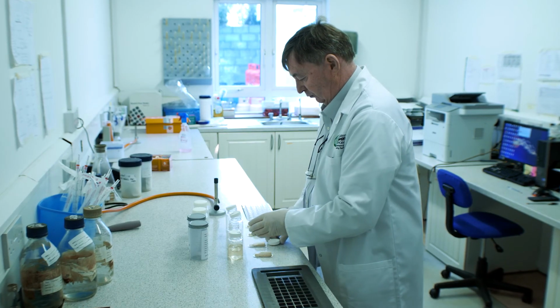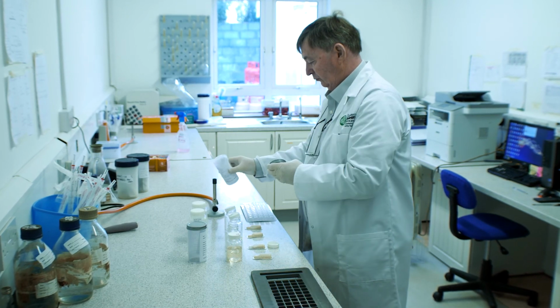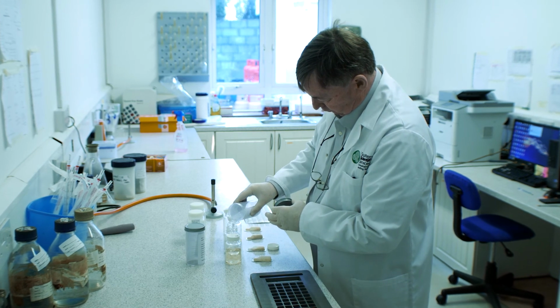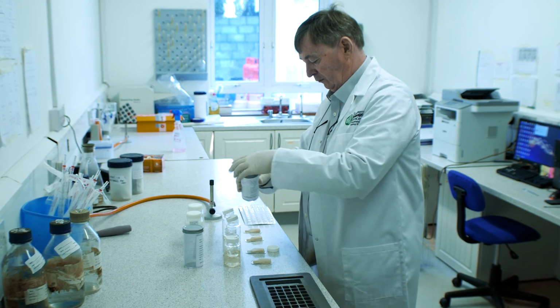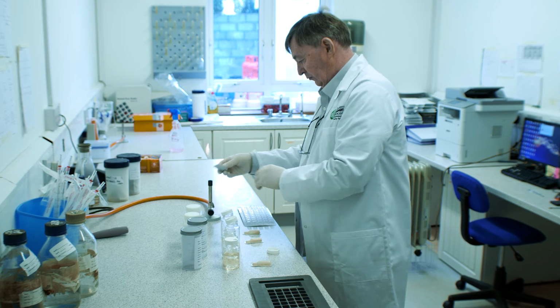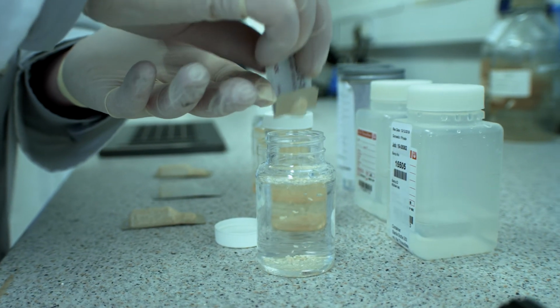Note that water tested for drinking purposes is also suitable for animal consumption, food preparation, and for several other industrial processes such as washing and the cleaning of products, containers, surfaces, preparation of detergents and cleaning solutions, preparation of certain cosmetics and healthcare products, preparation of certain industrial chemicals, and specific applications where water is used for cooling, heating, and ventilation.